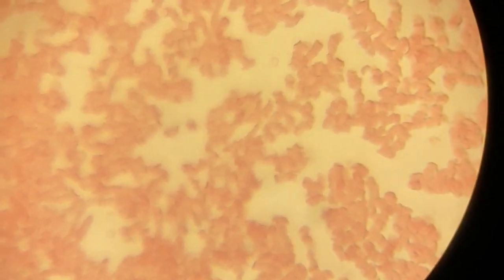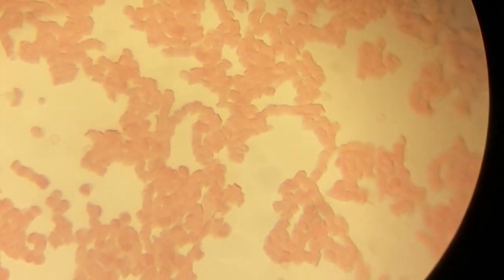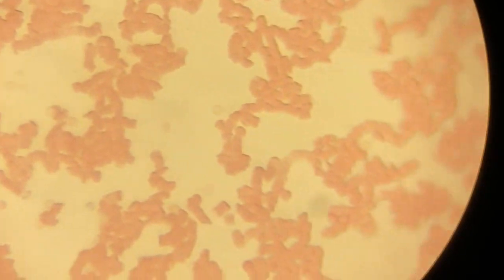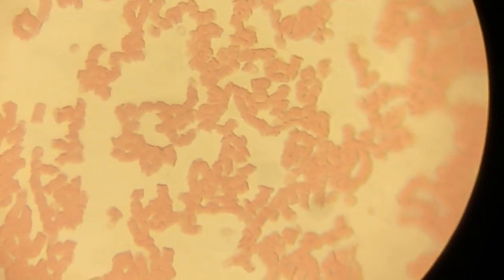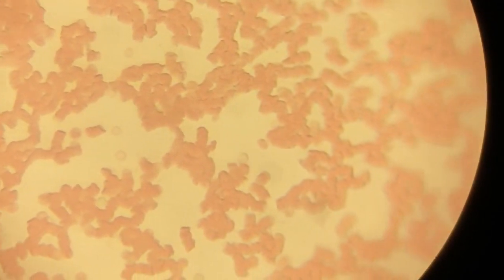This is my morning blood and as usual I don't eat or drink before my experiments. My blood condition is not good at all — as you can see, all the blood cells are stuck together in some heaps. That is not good; blood cells should be separated because they transport different things all over the body, and if they are stuck they can't do what they should do. In the morning I quite often have this blood condition, especially if you have dinner late.